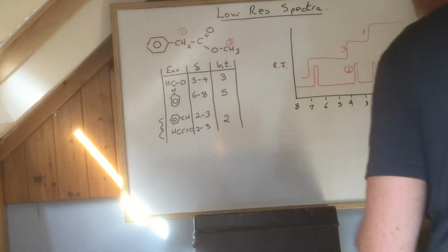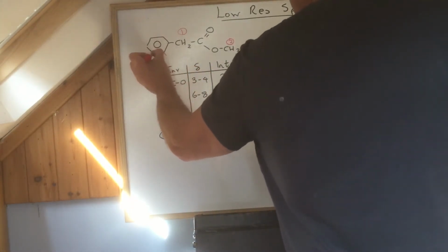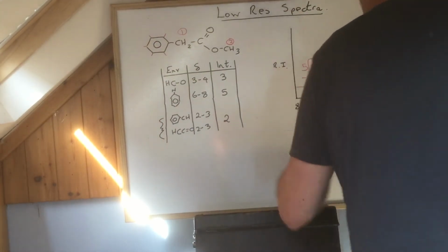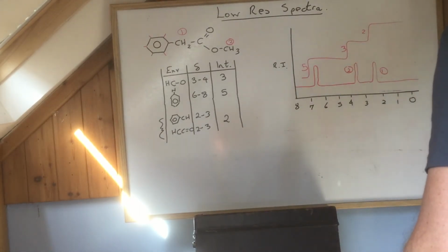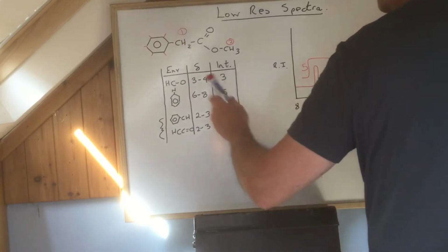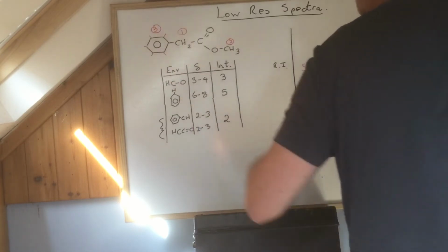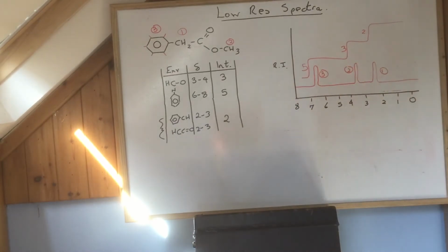Last but not least, the benzene ring protons, there's H's on here. Be clear, 1, 2, 3, 5 H's on there. Hence an integration of 5. And in the chemical shift region, if you look at your data sheet, that there, 6 to 8. So, in other words, those protons in the benzene ring we'll label as 3, put a 3 there and put a circle around it.